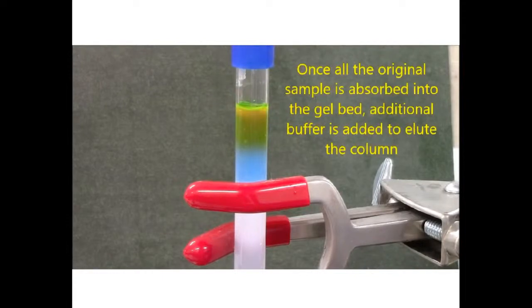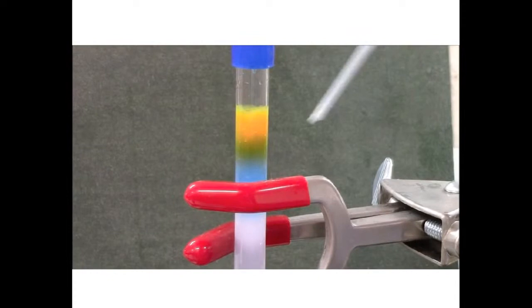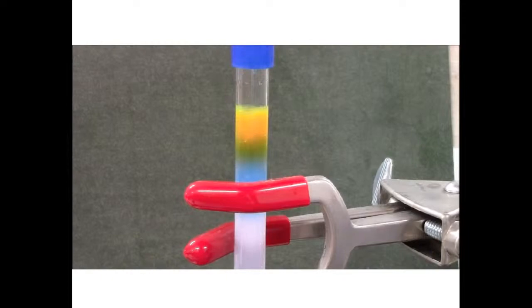I'll just add a fraction of a milliliter first, to help get everything into the gel before I add a large volume of buffer. So now the separation has proceeded somewhat. I'm going to try to add a decently large volume of buffer on the top this time. About a milliliter would be great.